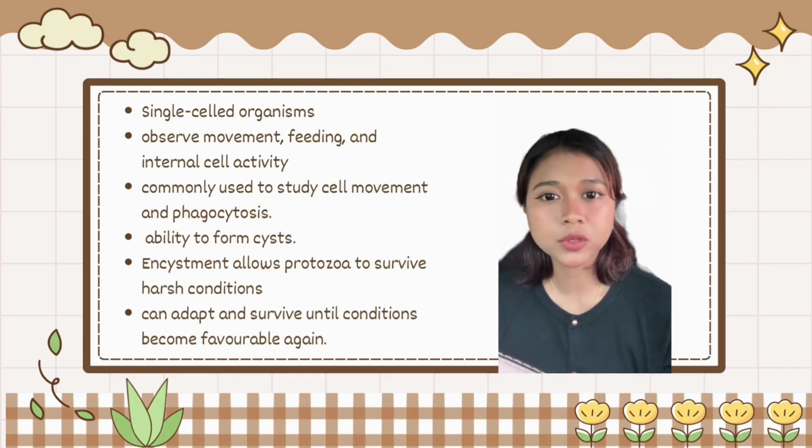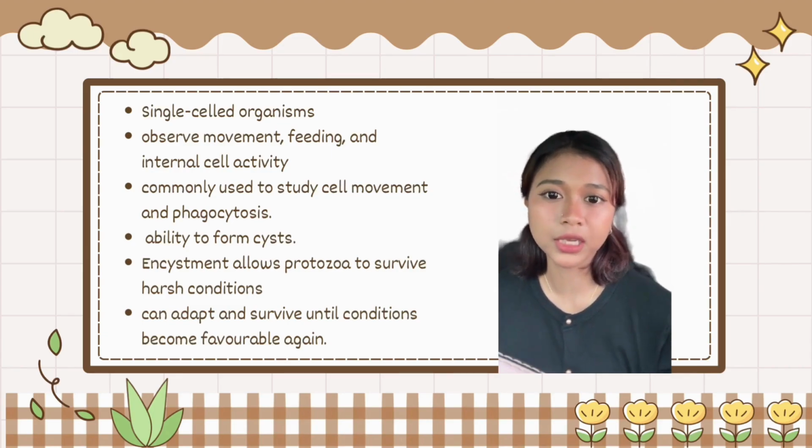One important feature of protozoa is the ability to form cysts. Encystment allows protozoa to survive harsh conditions like lack of nutrients or environmental stress. During the study, cyst forms were observed in several samples. This showed that protozoa can adapt and survive until conditions become favorable again.